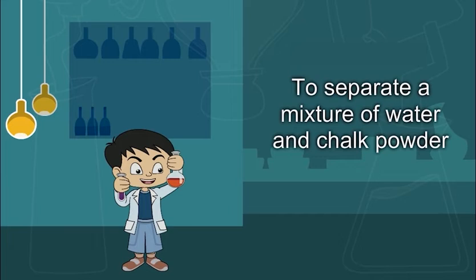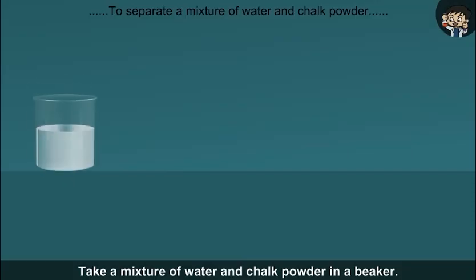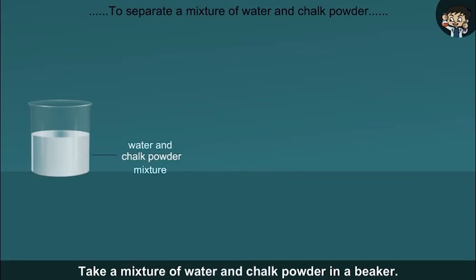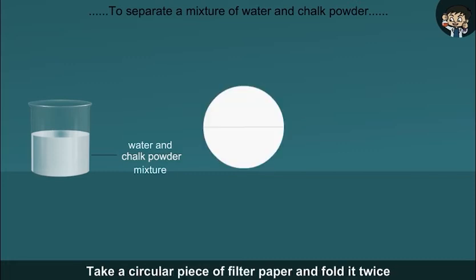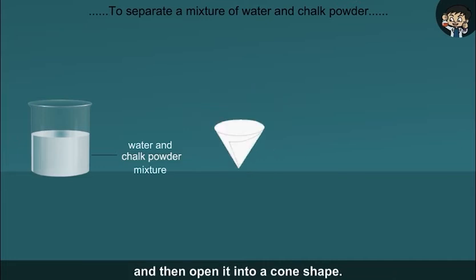To separate a mixture of water and chalk powder. Take a mixture of water and chalk powder in a beaker. Take a circular piece of filter paper and fold it twice and then open it into a cone shape.